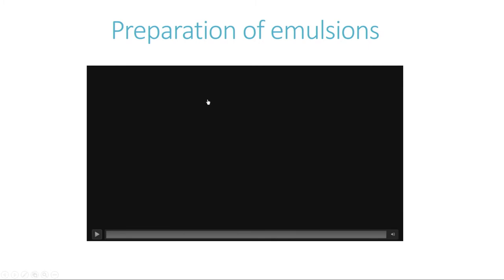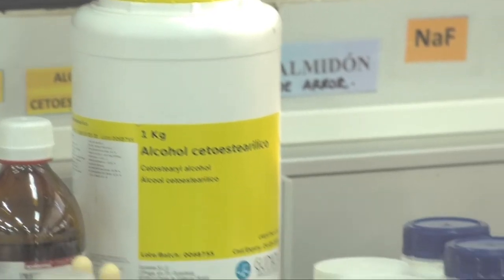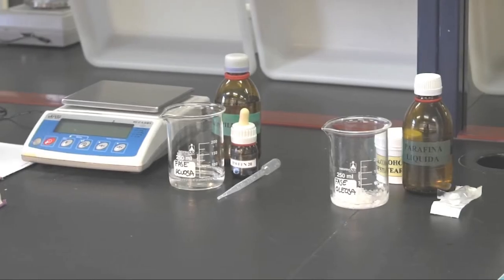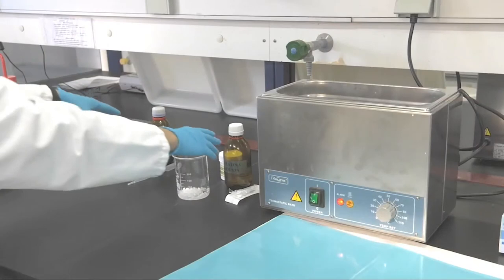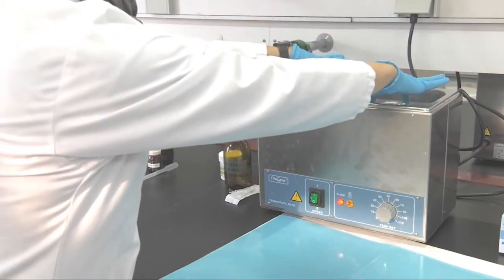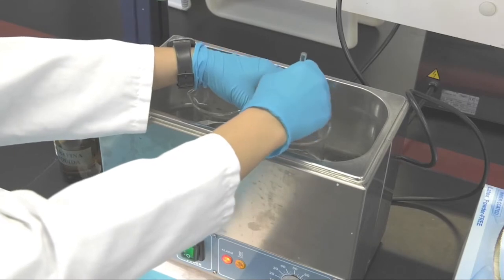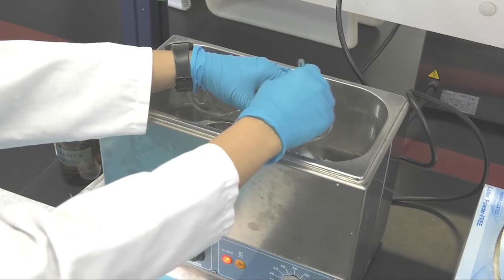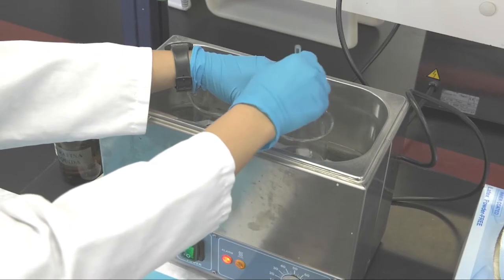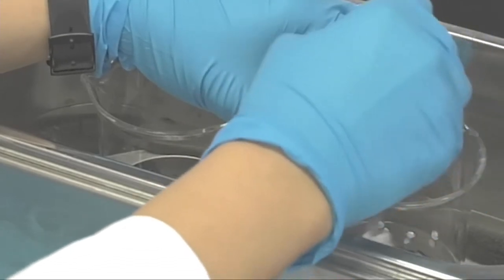In this slide we are going to see how to prepare the emulsion we have been talking about. We have all the materials in the video — cetostearyl alcohol and all others. We weigh them into two separated beakers: one contains the aqueous phase and the second contains the oily phase. They are placed in a water bath at the same temperature so that the oily excipients melt and the aqueous excipients are heated to the same temperature. Otherwise, the oily phase can precipitate and the addition of the water phase could be non-homogeneous, and we would not prepare the cream appropriately.